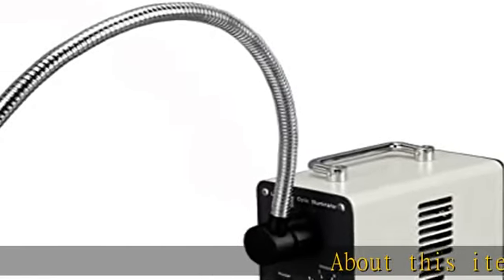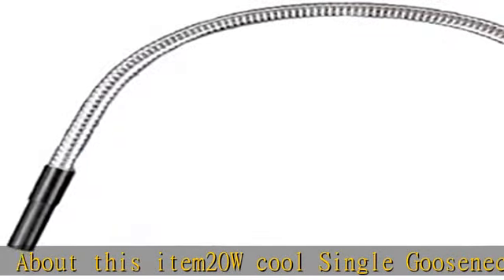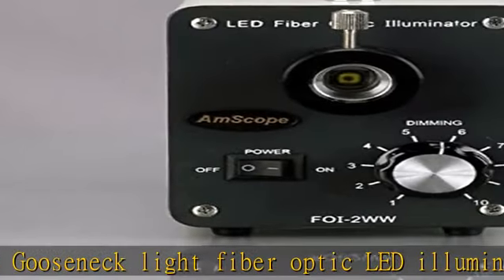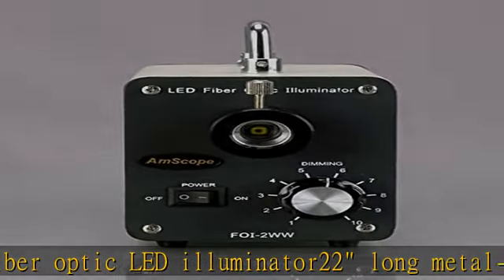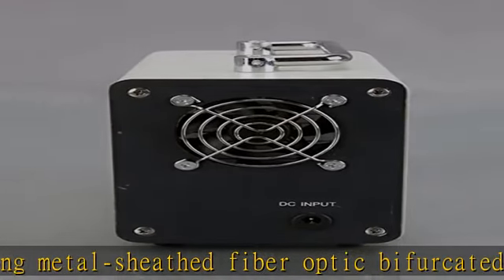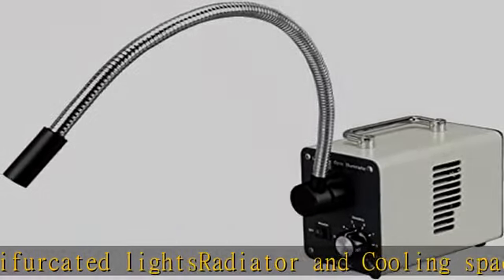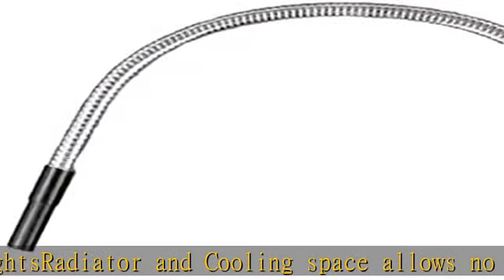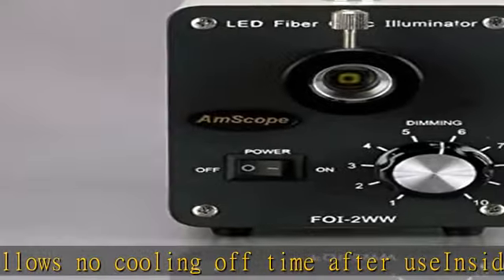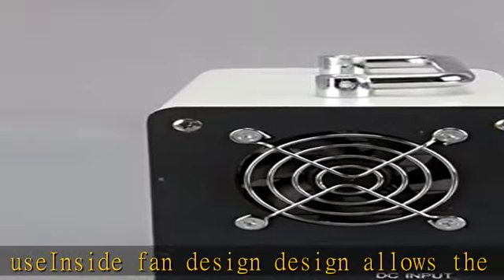20W cool single gooseneck light fiber optic LED illuminator, 22-long metal sheath, fiber optic bifurcated lights, radiator and cooling space allows no cooling off time after use. Inside fan design allows the illuminator to work with low noise. Check the description to get this product today at the best price.